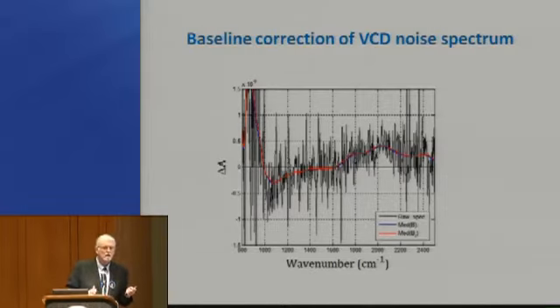But how about the really sharp bands? Are those intensities maintained? Yes, they're well maintained. We haven't actually looked at the area. Something that we should do is actually look at the area. Is the area that's cut off on the wings compensated by the peak of the band? It's certainly higher, but it looked to me as if there was a little more area in the wings than there was above that, and it's something we have to do.